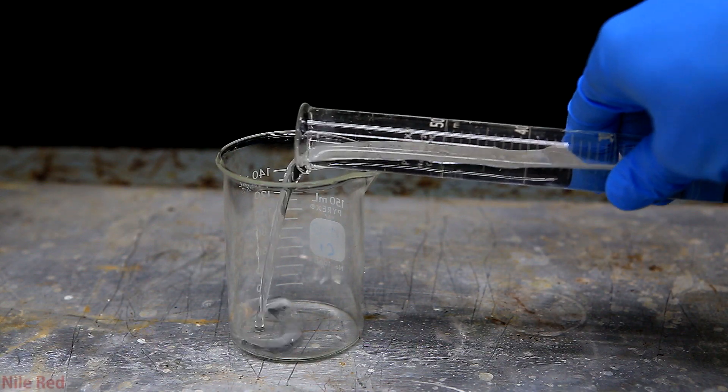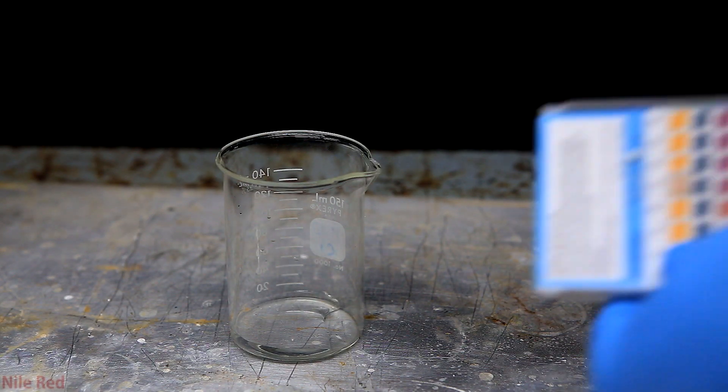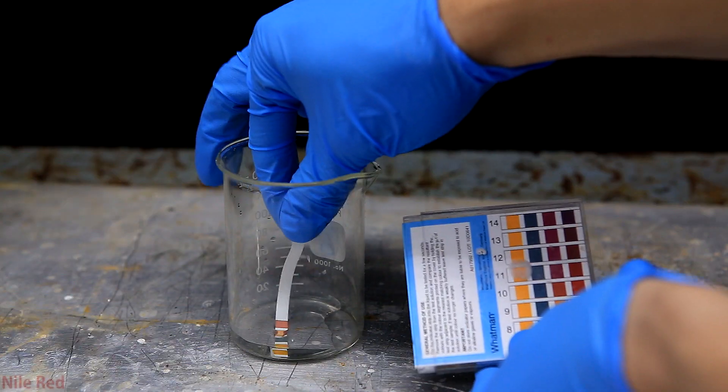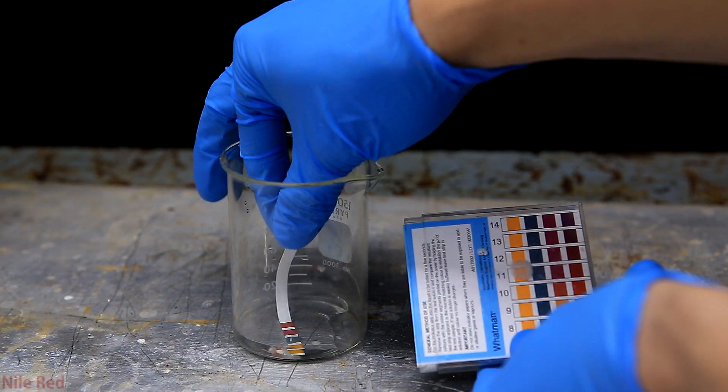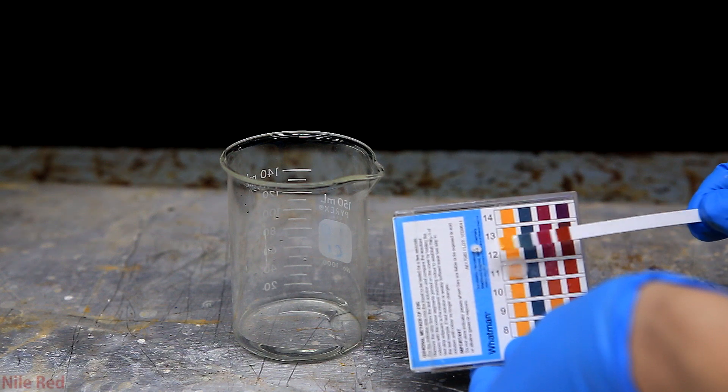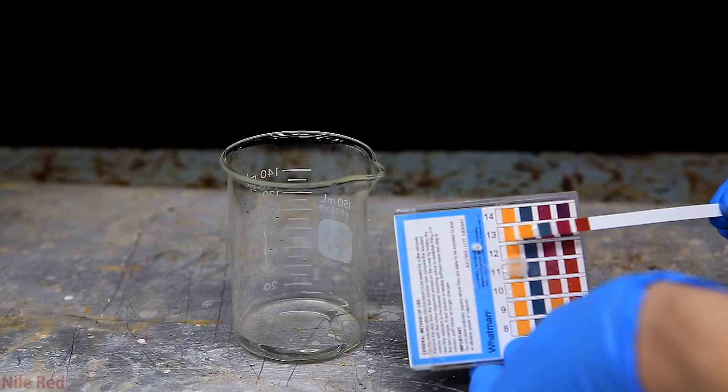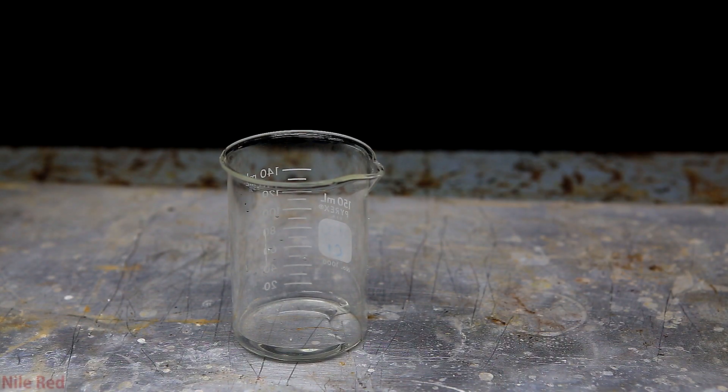After a little while, our ammonium hydroxide solution is removed from the generator and I add a little bit to a beaker. Using some universal pH strips, we can test the pH and we can see that it's mildly basic. Ammonia is a weak base, so it doesn't ionize super well in water. So especially when it's a little bit dilute like the solution we have, the pH isn't going to be super high.